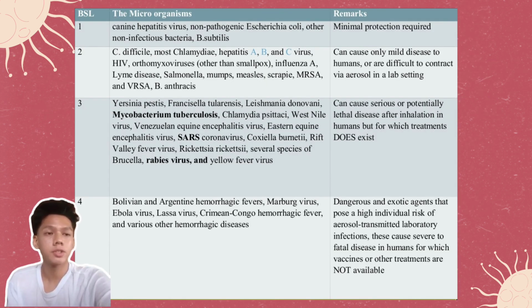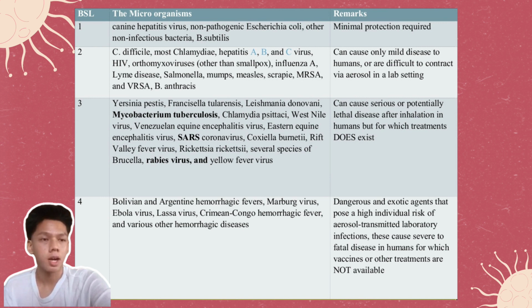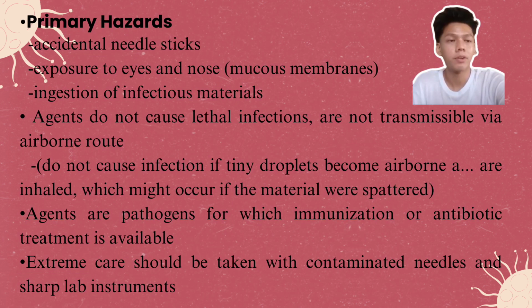Here is additional information about our topic. Under BSL, we have 4 categories: their microorganisms and their remarks. Primary hazards: accidental needle sticks, exposure to eyes and nose.